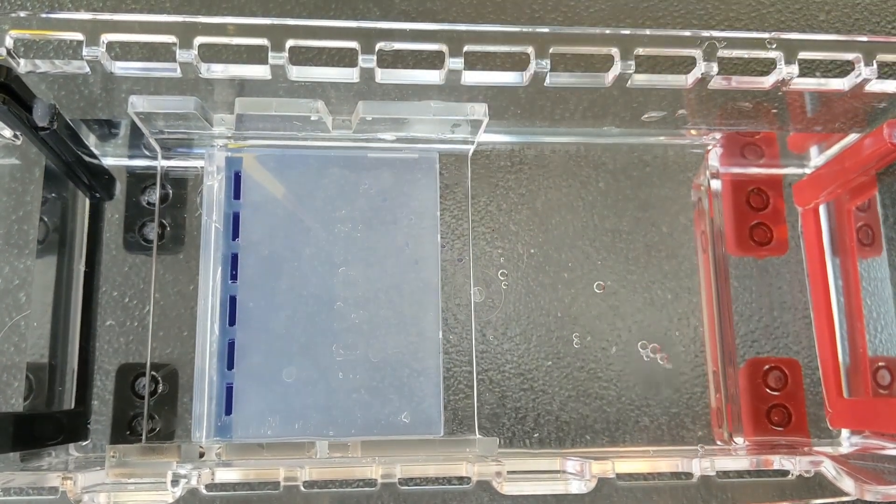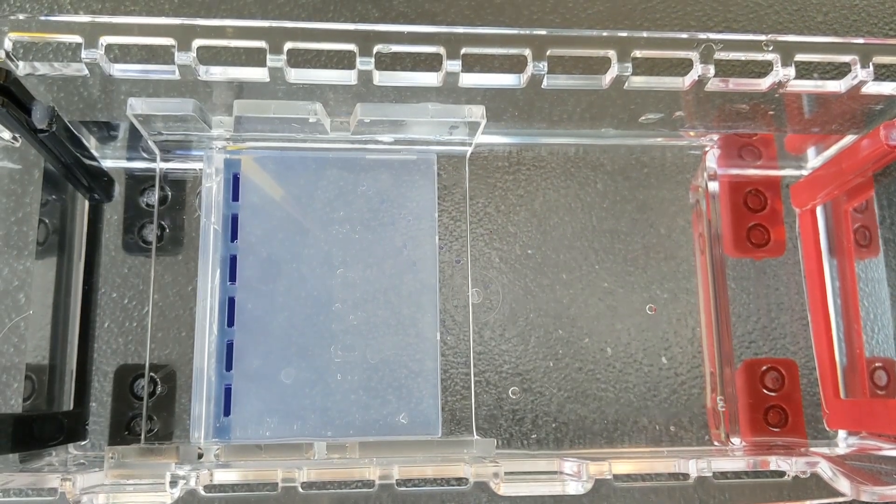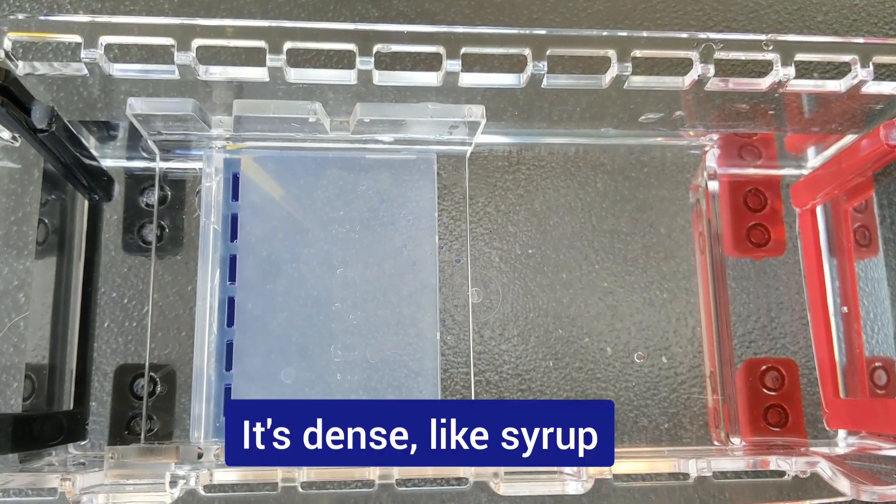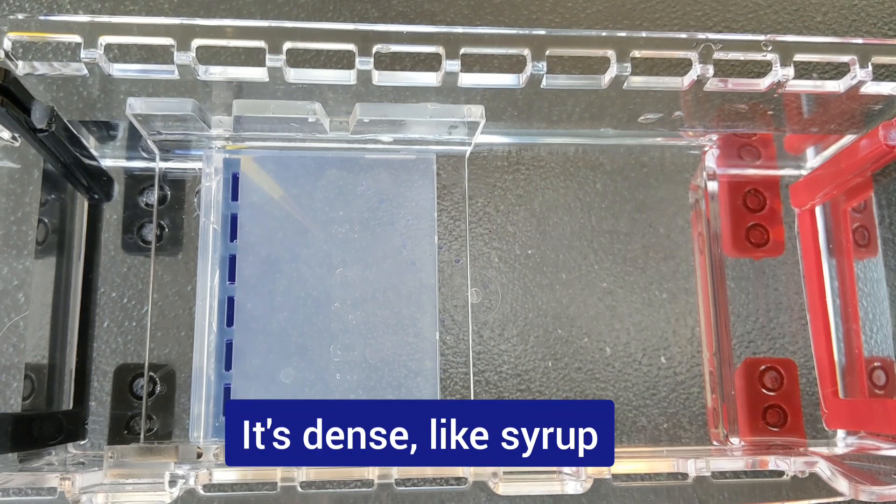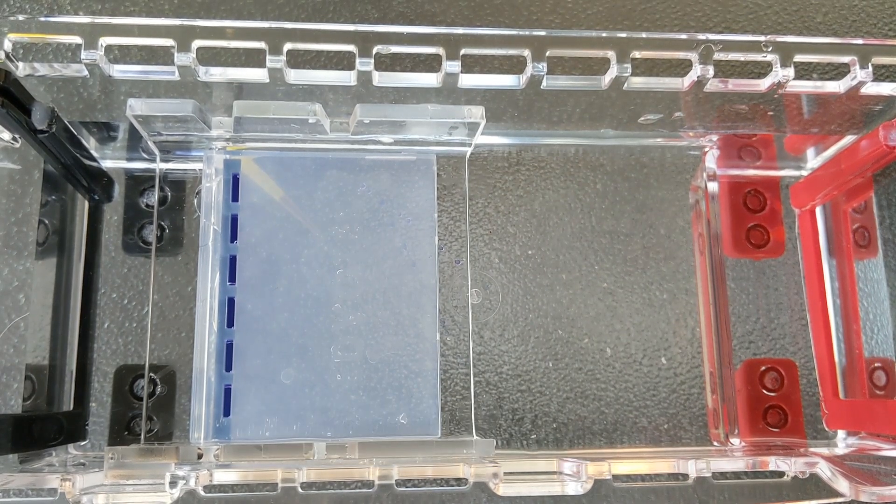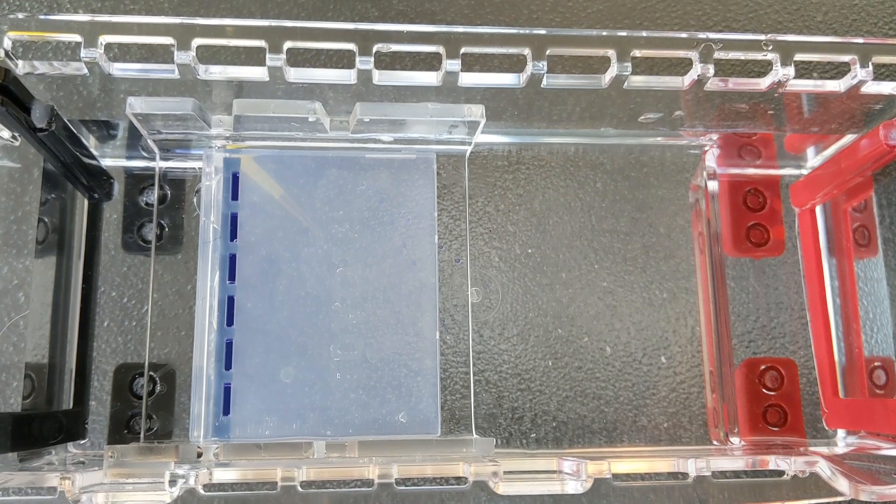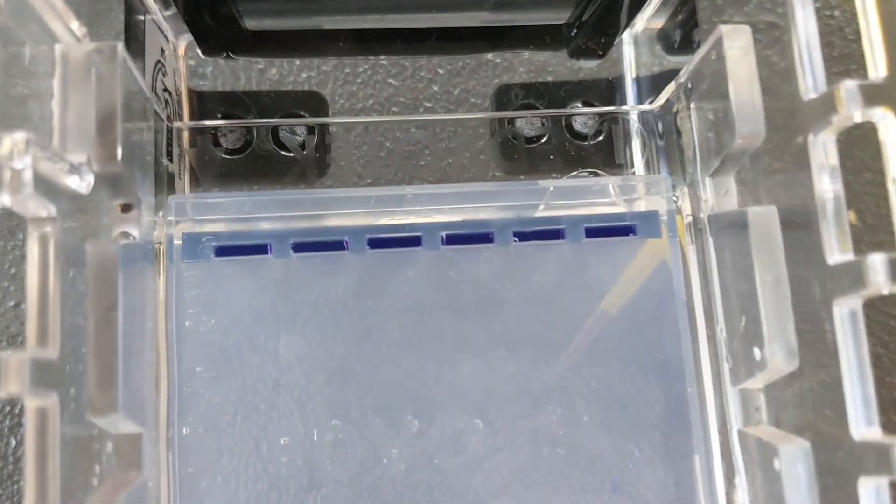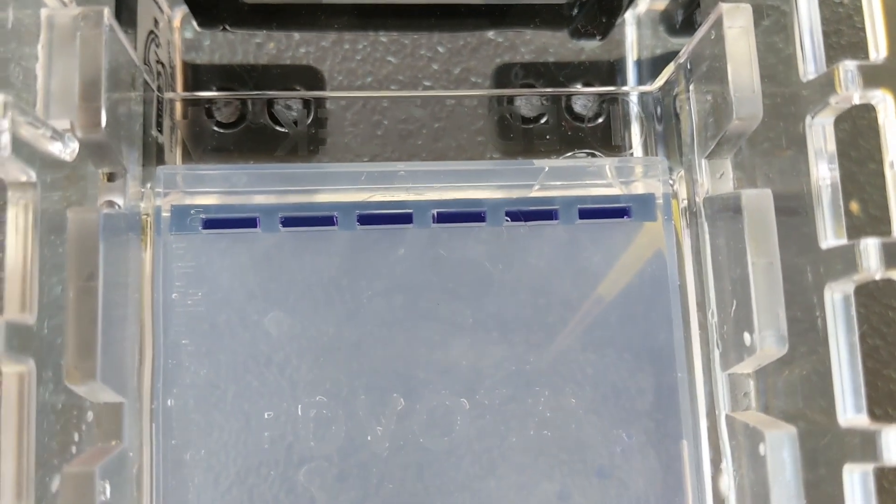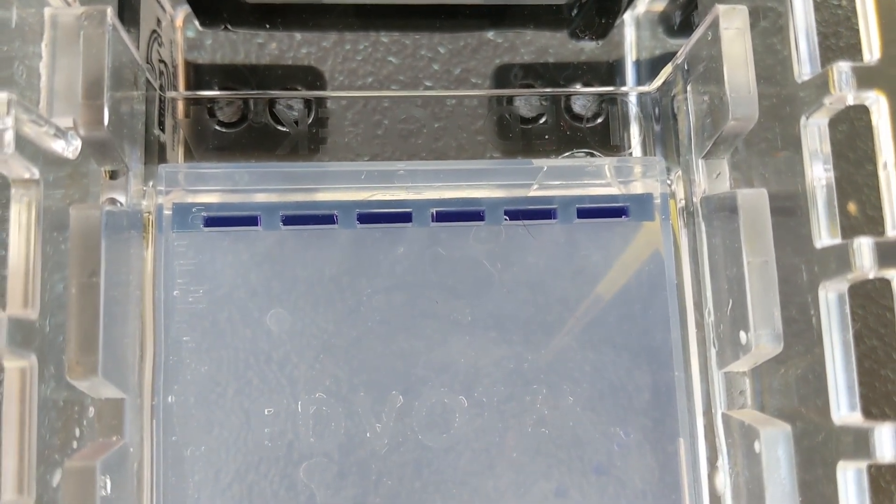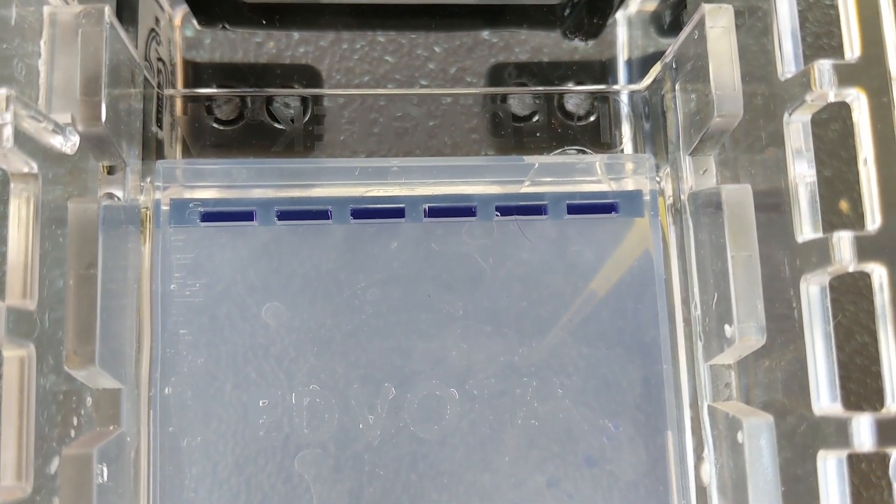The gel loading dye is heavy, so it does help keep the DNA down. So you can see, even though the buffer cascaded over it, the DNA is still really beautifully loaded. Nice dark wells. I undoubtedly got a much better load from my dry loading, at least with this sample.